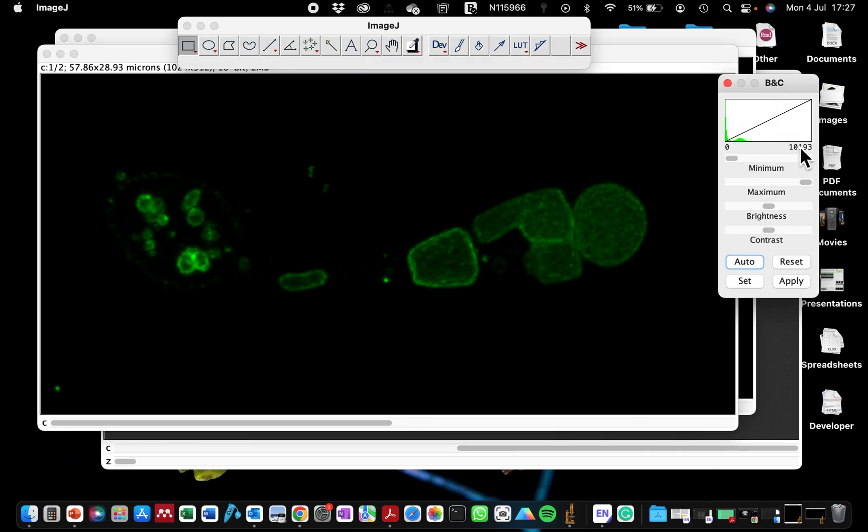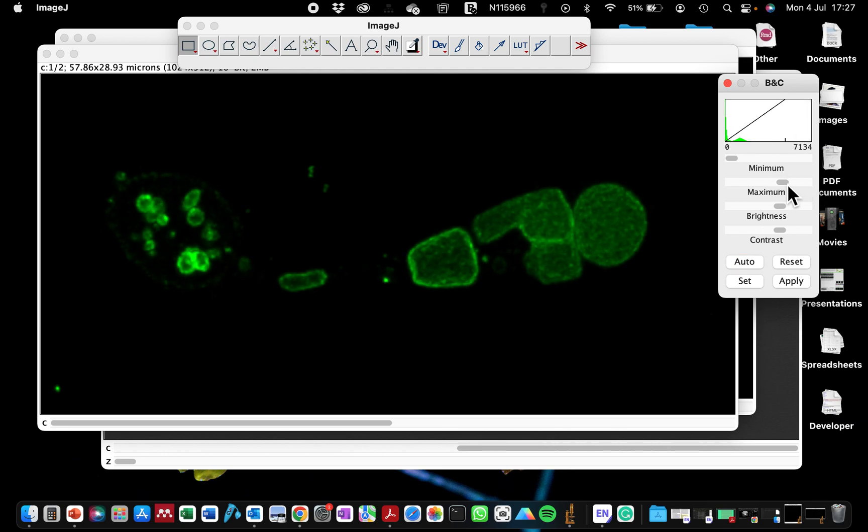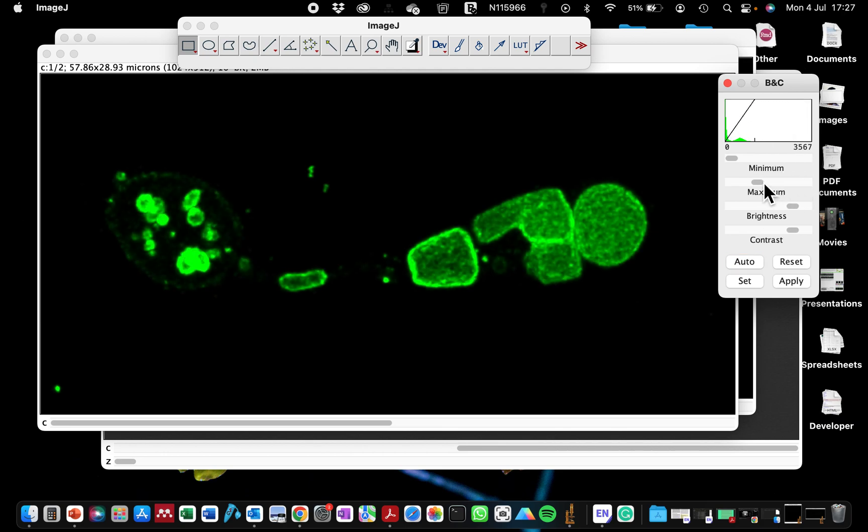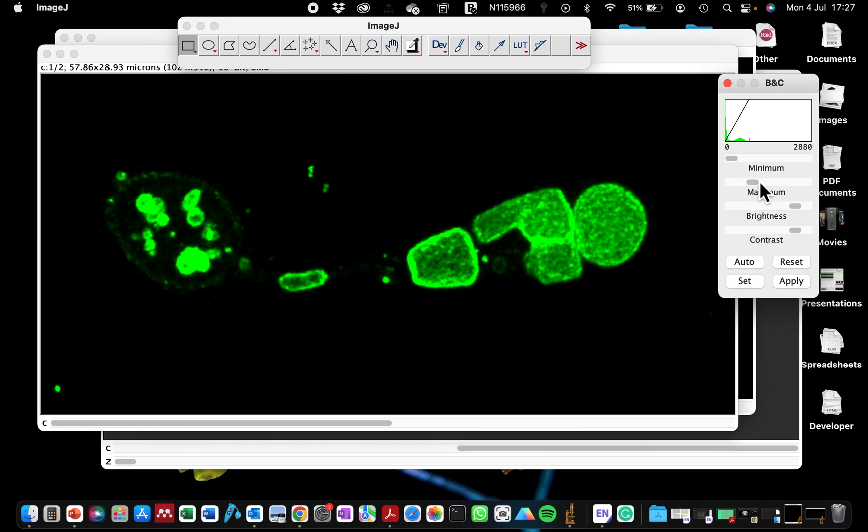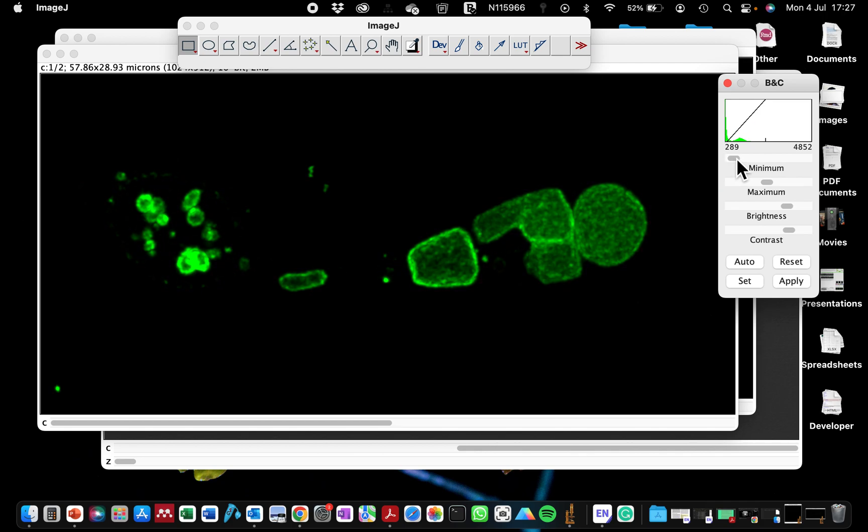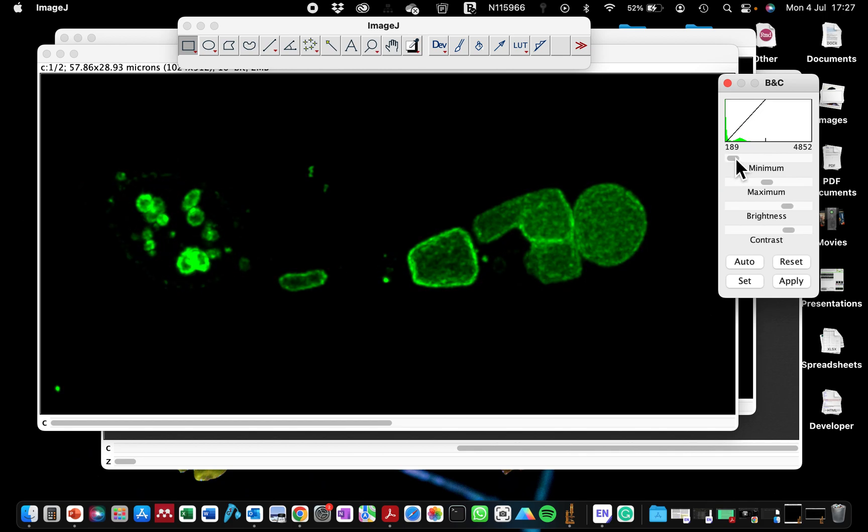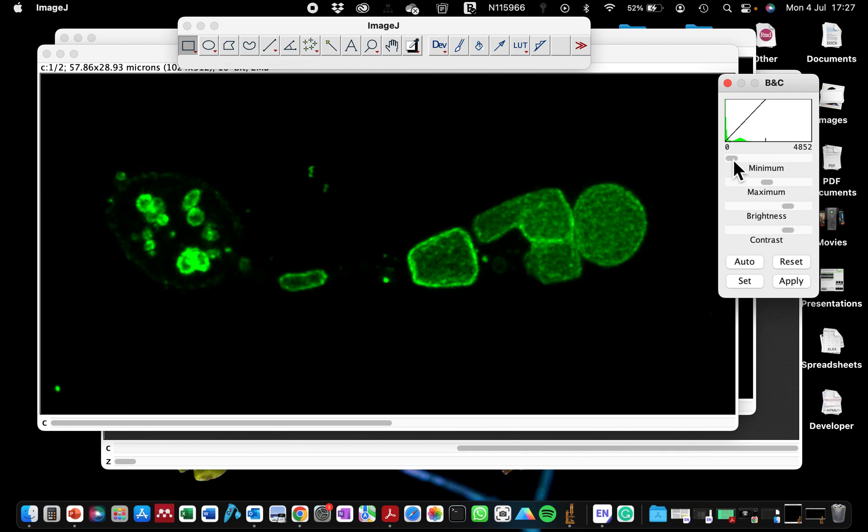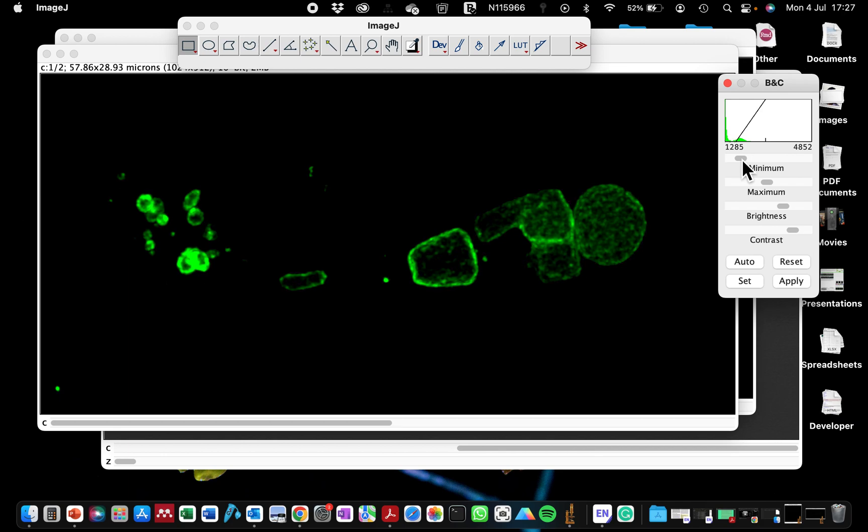However, you can see the signal is no longer 65535. So the first way is just to you can just drag these until you are content with the brightness of your fluorescence image. So you can adjust this to reduce the background noise if you don't want any noise.